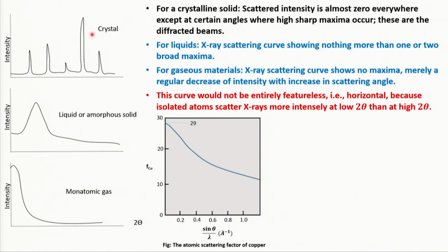So for a crystalline material, you will be expecting this kind of sharp peaks. For liquid, if you take an X-ray diffraction pattern, the interatomic spacing is continuously changing. Between various atoms, you have a completely different interatomic spacing. Of course, statistically they will have a preference towards one single value, but that will also be a large range. So correspondingly we will have this kind of X-ray diffraction peak, where you will have a very wide and broad peak in the material. You can think of this as one extreme of this size effect.